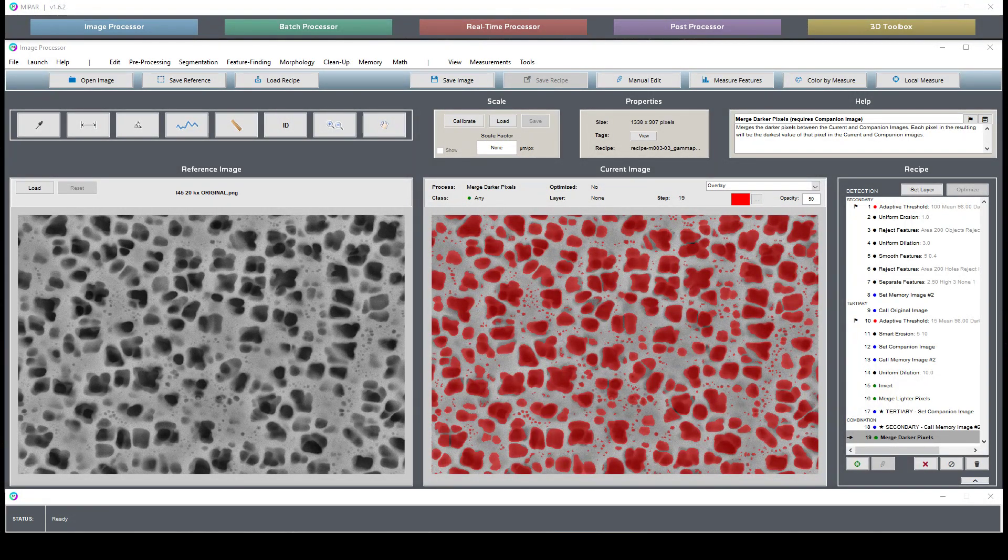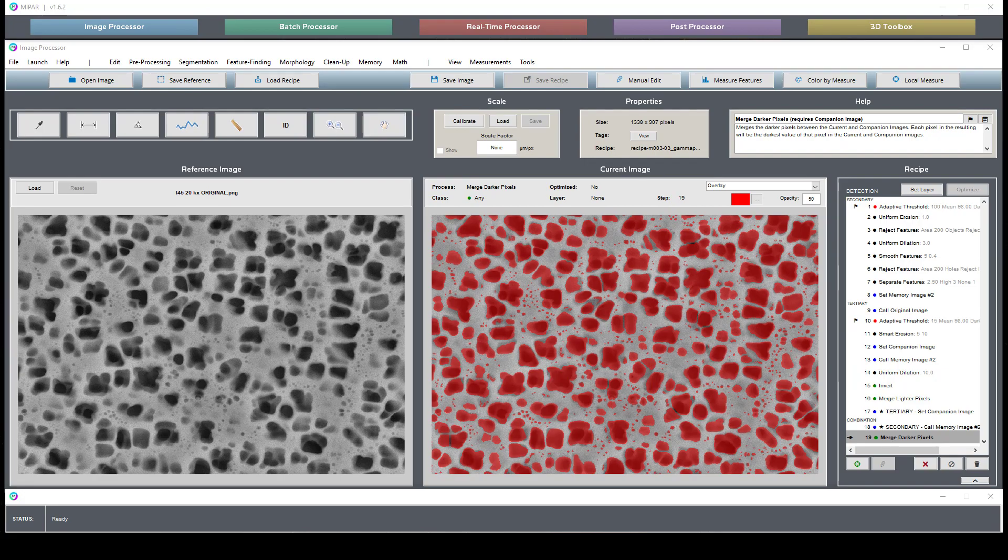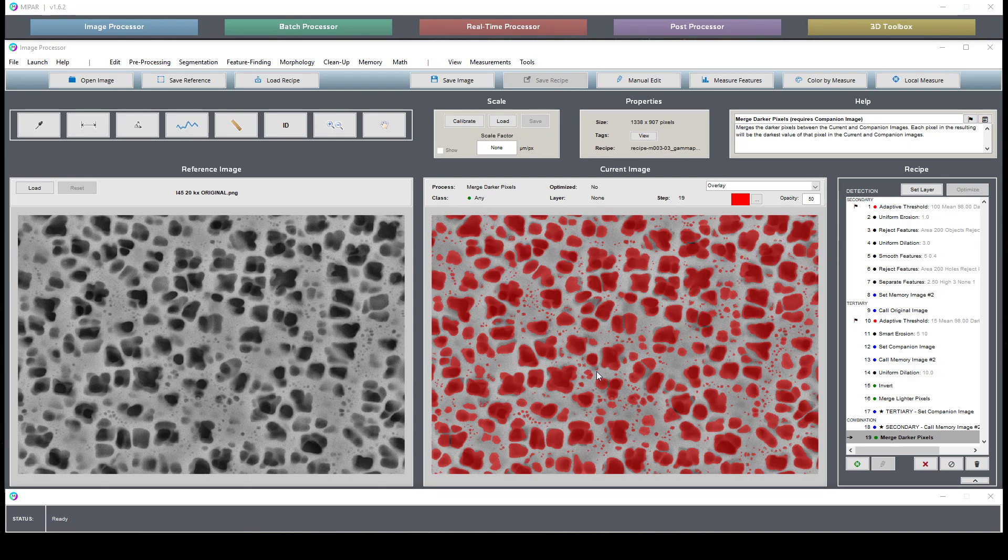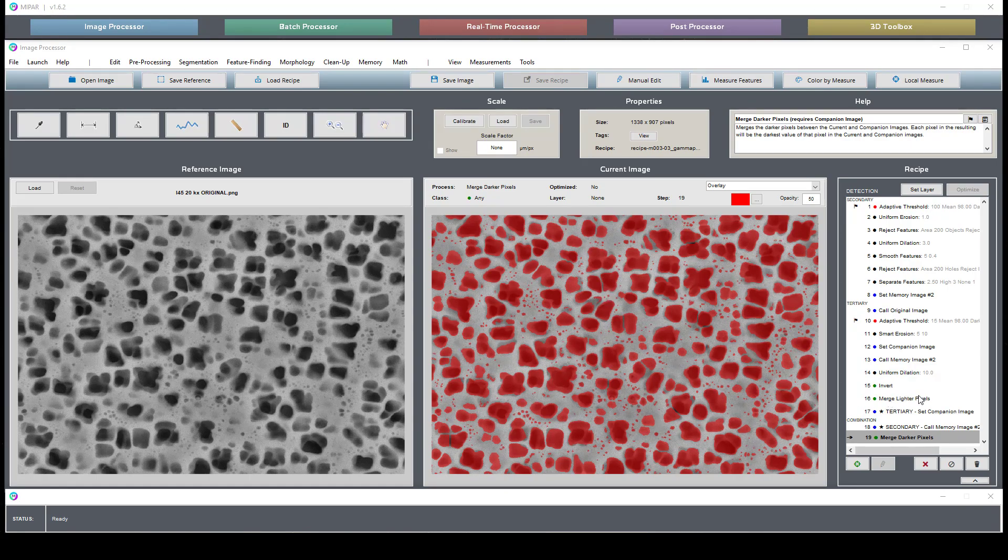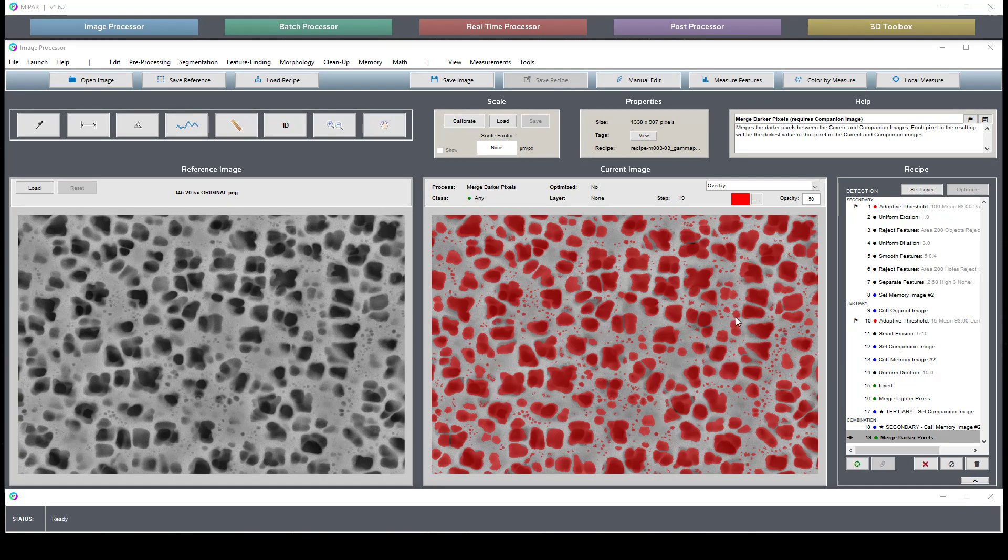This is a short video outlining the bimodal gamma-gamma prime in nickel recipe and image found in our recipe store. This recipe is made to identify tertiary and secondary phases in this material, and this approach is a good example of how we look for phases or particles in material.